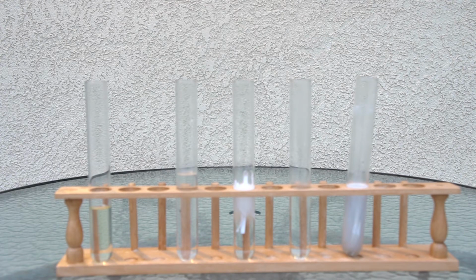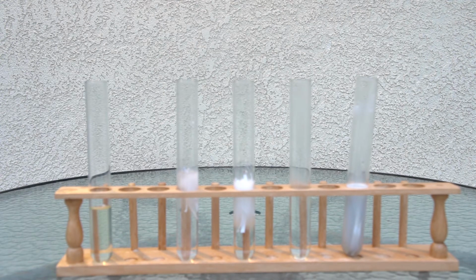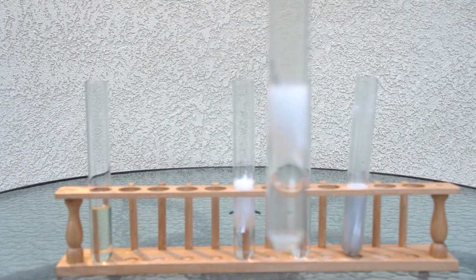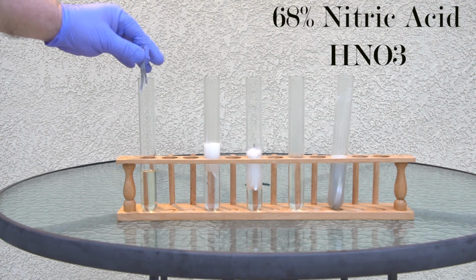Next was dilute nitric acid. Now, the dilute nitric acid reacted fairly well, and it produced either hydrogen gas or nitrous oxide, N2O. I've read reports that in certain concentrations, magnesium ribbon and dilute nitric acid can produce nitrous oxide, but I was not able to independently confirm that that was what is being produced in this reaction. One thing I do know is the reaction with nitric acid is quite different.